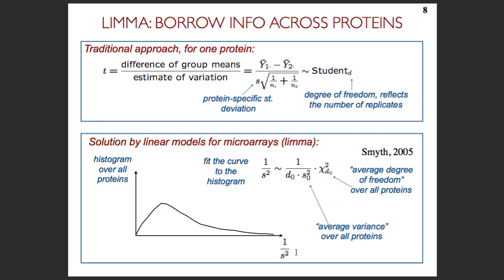In MSstats, we found that we advocate for more than 3 replicates, if possible. And so we found that if we do the summarization right and we reflect the design right, LIMMA doesn't really bring as much to us. And we did very extensive evaluations for that. But it does add extra code, extra places for bugs, right? Extra places for errors.